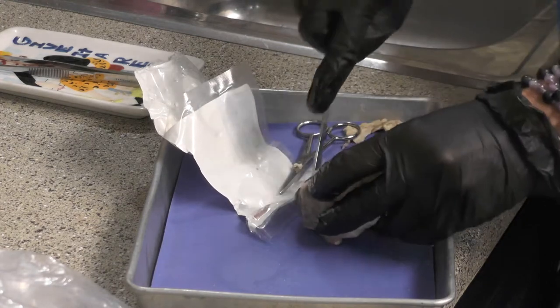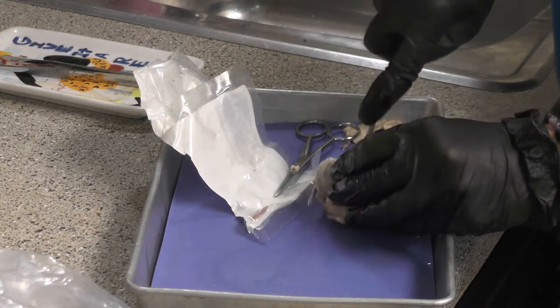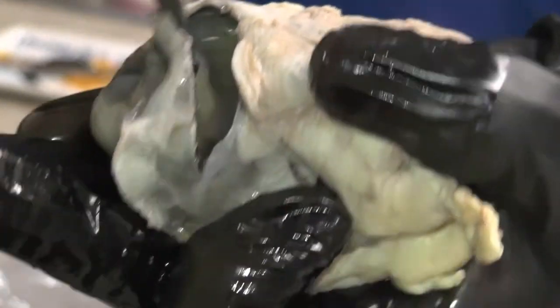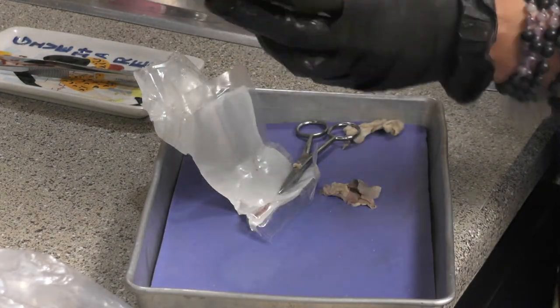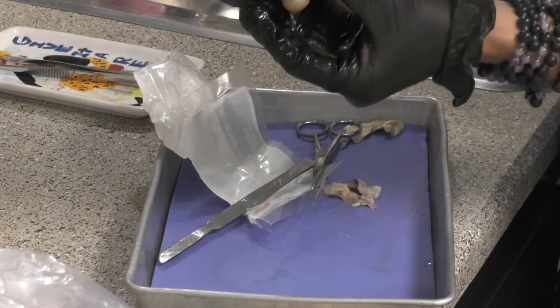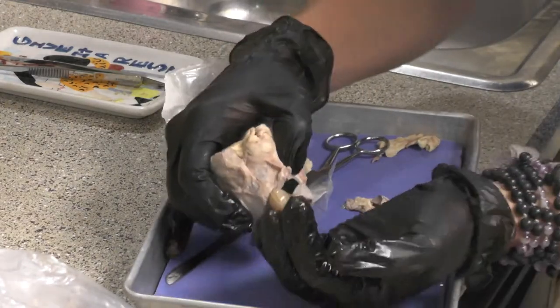Coronal section — trying to get right between the anterior and posterior segments is the best cut to make. I think I blew it, but if you can get there, okay. So look what we can see in here — this is my posterior segment that's full of vitreous humor, and that is the lens that I'm going to be able to pop out. I can hear all the membrane rupturing — here comes my lens. I just want to show you how thick vitreous humor is.